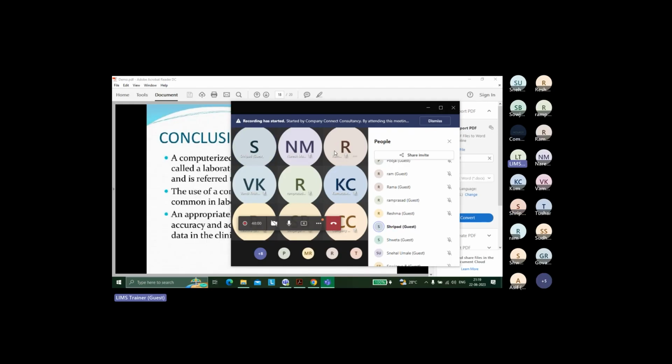functions. I'll show you with screenshots that you go to this user table, you click here, you assign this function, okay, approve sample, then only you will be able to approve sample. If I remove this function, you won't be able to. So this is how you will know from the backend, and you will get the confidence as to why I'm able to approve this. Now, when the picture becomes clear, you yourself will again open the manual and try to read and understand. I'll give you the push, and now you will climb the ladder yourself. That's my effort. Thank you.